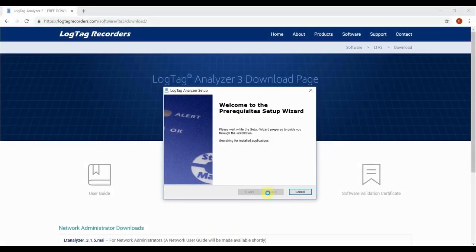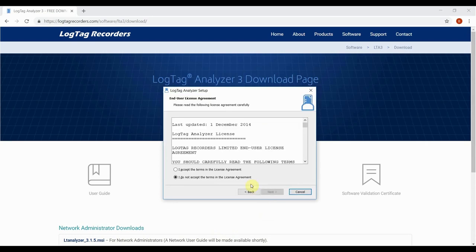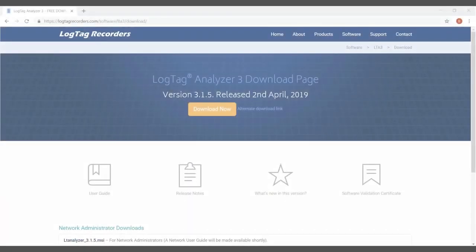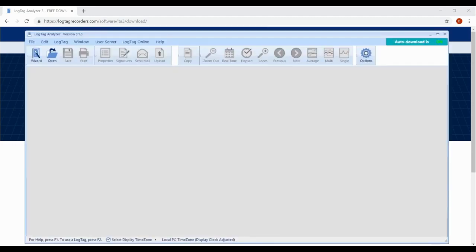Once downloaded, install the software by following the on-screen instructions, then open the software by clicking on the shortcut on your desktop or from the start menu.